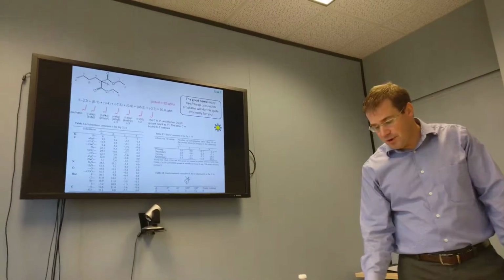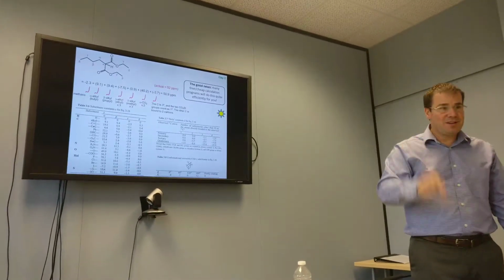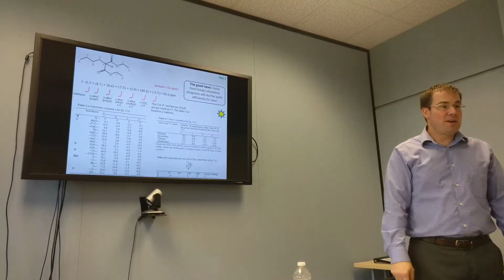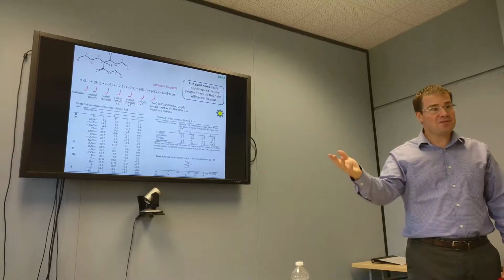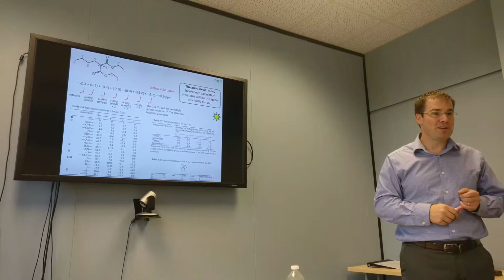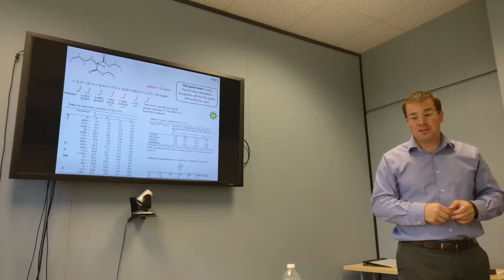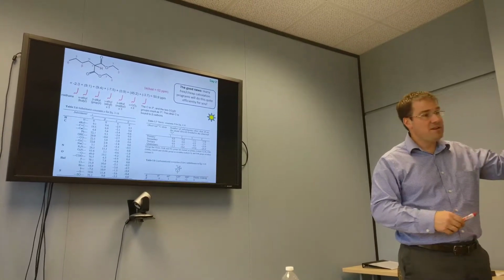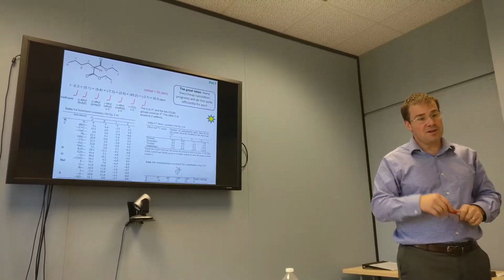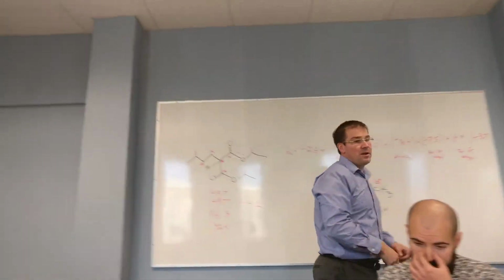Okay? So those of you who have the full version of ChemDraw, when you draw your molecule in ChemDraw and hit predict carbons, ChemDraw is very dumb. It doesn't do any of this fuzzy logic stuff that MNOVA does, and doesn't really know very much about what the molecule actually is, but it is really good at working through this additivity table fairly quickly. And so these kinds of additivity calculations are exactly what ChemDraw is doing, and I'm pretty sure it even knows how to read off this steric correction correctly.